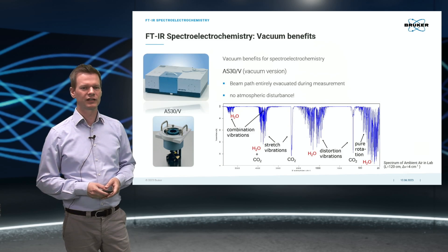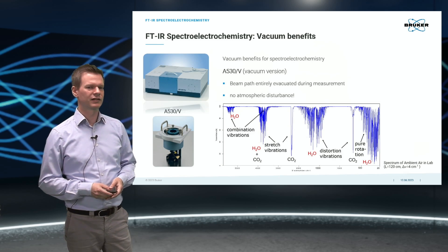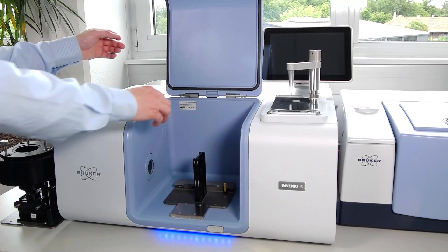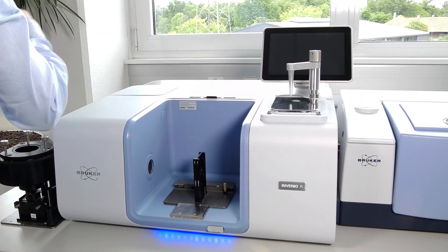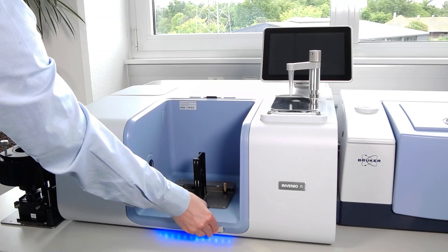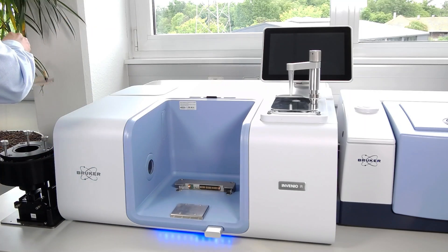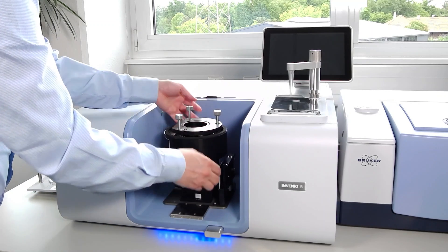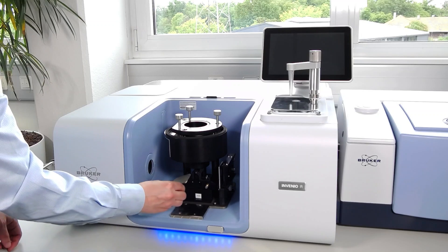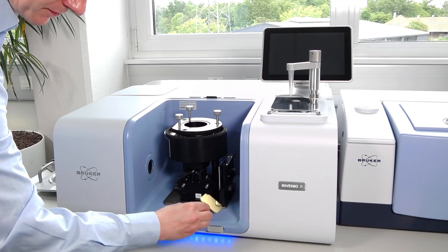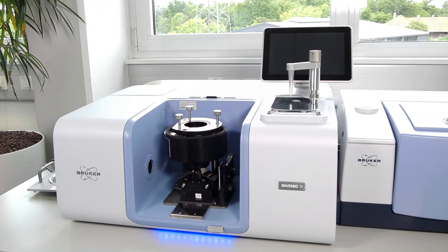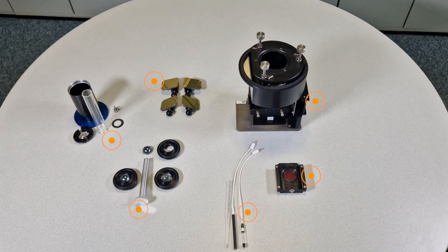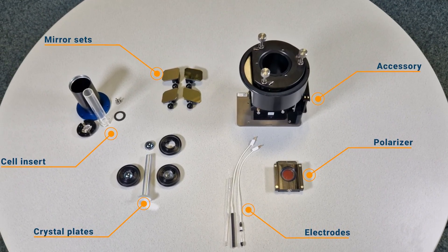Now we will have a look at the A530 reflection unit in the lab and how it is prepared for an experiment. The A530 reflection unit can be easily installed into the Invenio FTIR spectrometer. Therefore, the standard cover is removed, and the standard transmission accessory is released with the quick lock button and also removed. Now the A530 can be inserted into the quick lock holder. Afterwards, the mirror pair with 30 degrees of incidence is installed and the mirrors are magnetically held in position. In this general overview you can see all components needed for the electrochemical experiment, grouped together with the reflection unit.